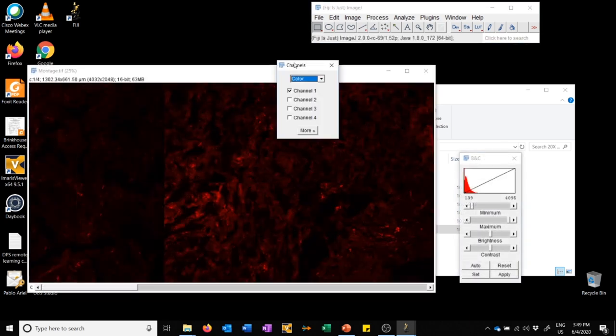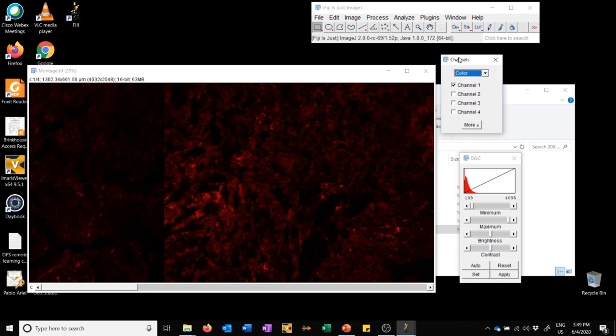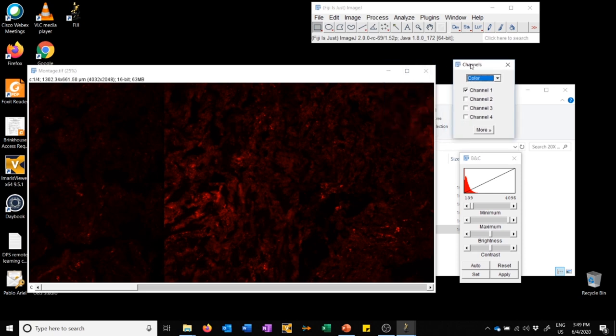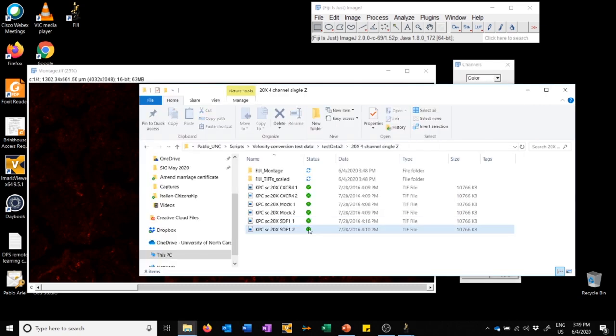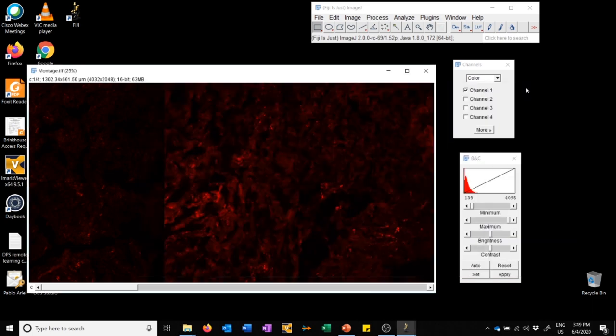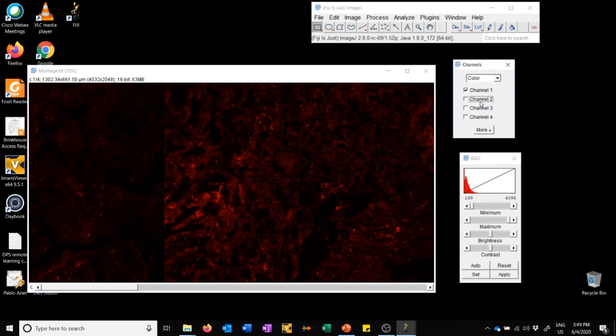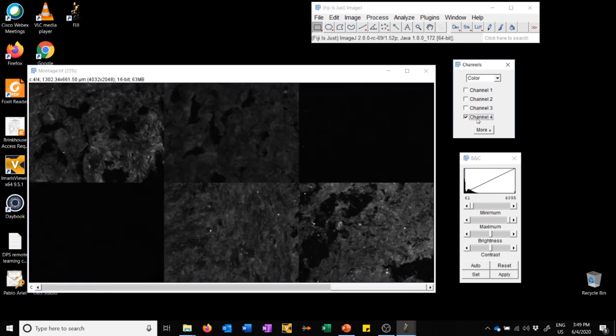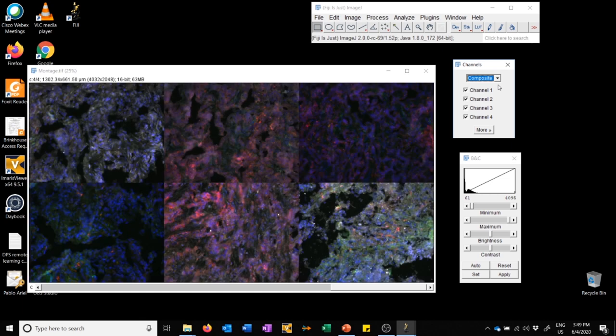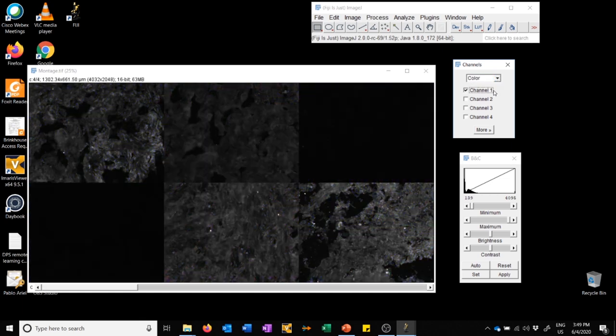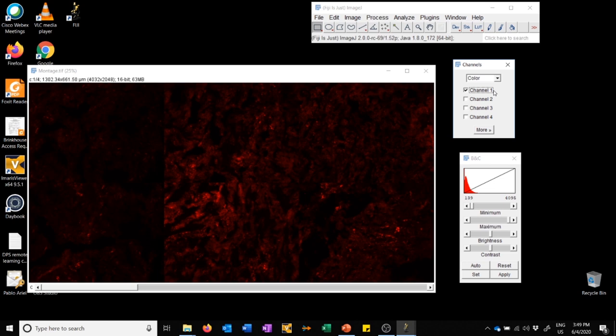What happens after this is the software creates a montage of all the images that were in the folder we pointed it to. There were six images in this folder, so we have a montage of six images. It also opens up this channels tool and the brightness and contrast tool. We can look at the different channels in our data by toggling here. We can look at a composite of all the channels by clicking here on composite. I'm going to go back to single color. The coloring scheme is, in this case, the default one: red, green, blue, and gray.